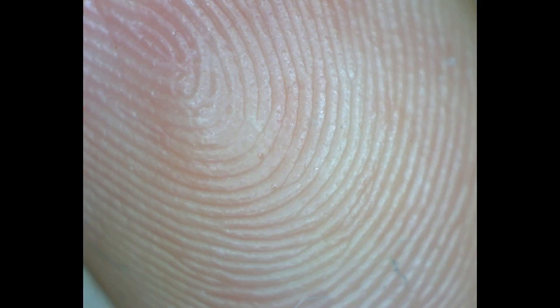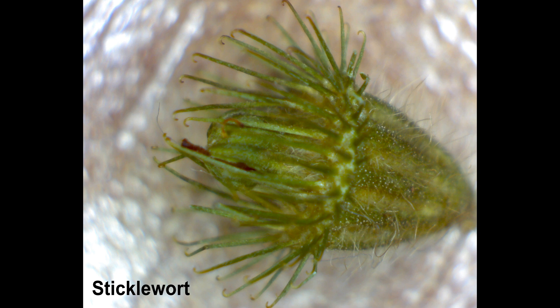Here's bread mold. Here's my finger — you can even see sweat pores with tiny sweat droplets. And here's sticklewort with tiny hooks.